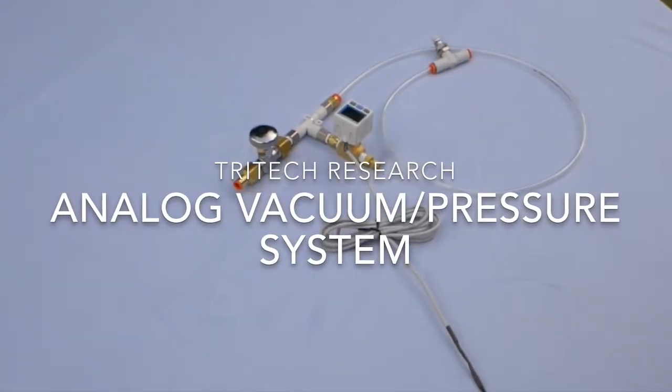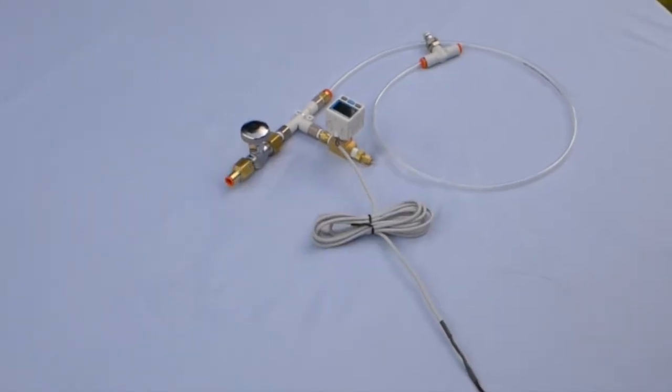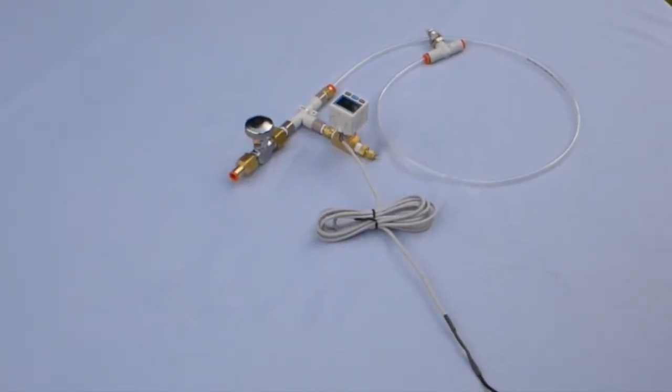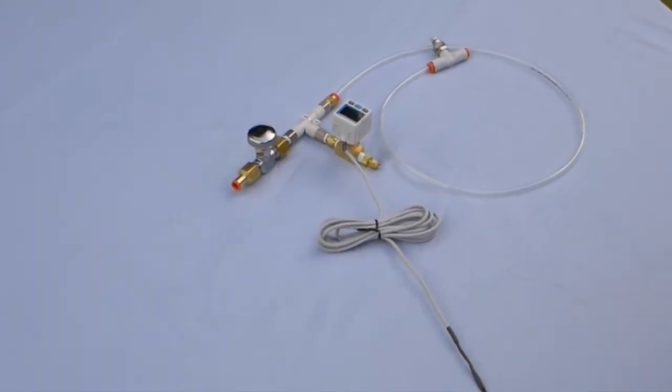Hi, this is the Tritec analog multi-pressure system and it can be used to create a positive or negative pressure starting with a positive pressure source.